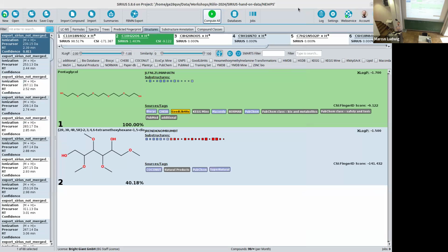Was there another question? Just my question: when you compute everything and then go to structure, you have the yellow database. Yeah. And I don't have it. And the question is why? So yeah, this is the one we are doing next. This is a custom database I specifically imported. So we can go this way. Everyone can now try to import their own custom database. So this is the one we are doing next for analyzing the whole data.